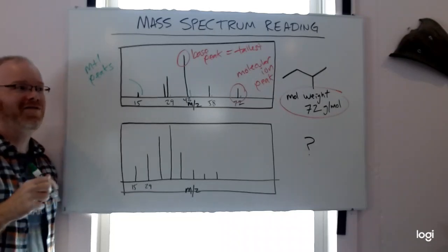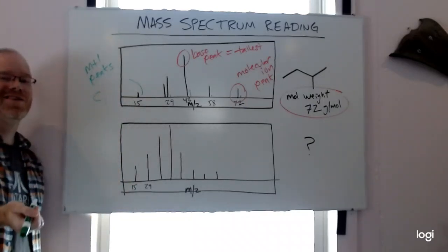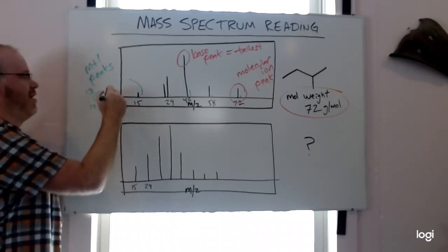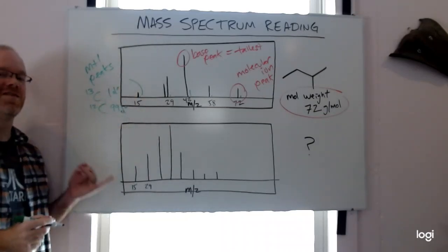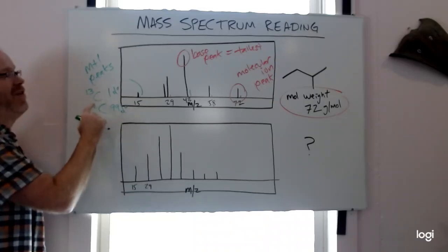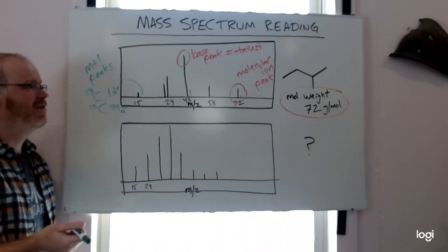So one in every 100 carbon atoms is carbon-13 instead of carbon-12, so 99% of everything we see is carbon-12 and 1% is carbon-13. But a drop of solution gives us billions of atoms, so even though it's only 1%, the machine can detect that, and you'll see these small peaks there. Not necessarily a lot you can do with that information, but it's definitely something to keep an eye on.